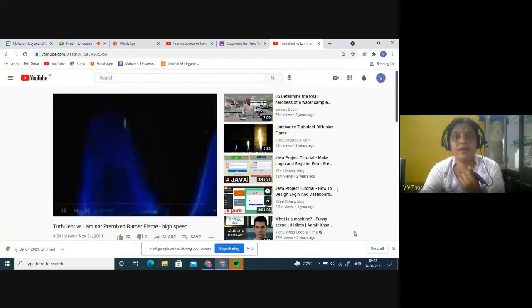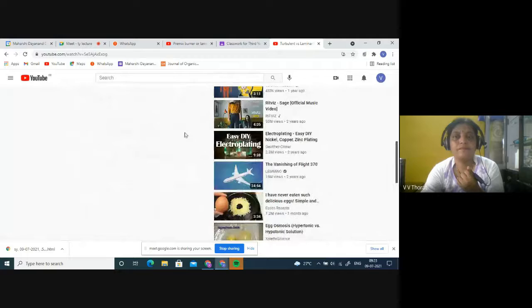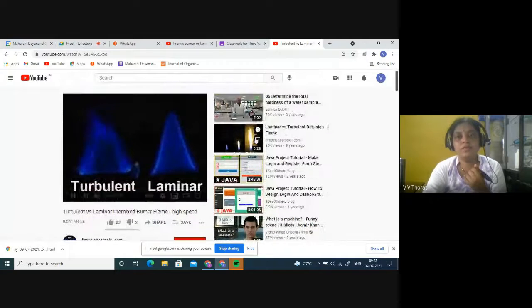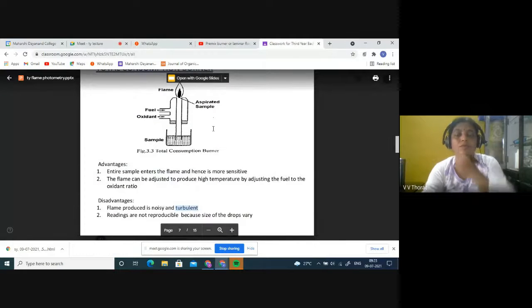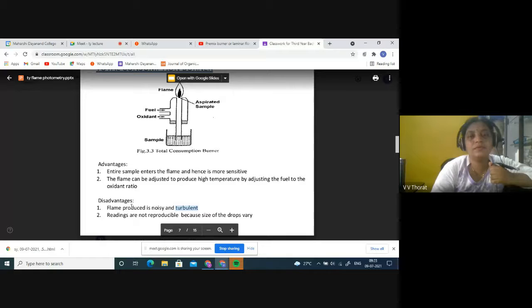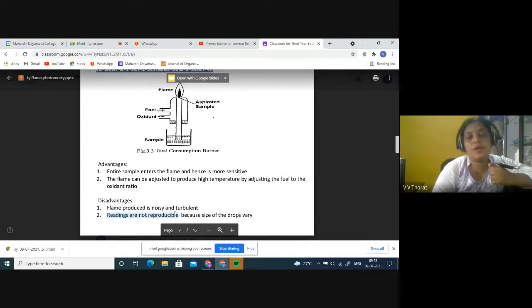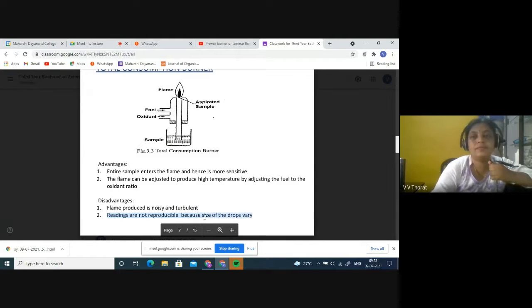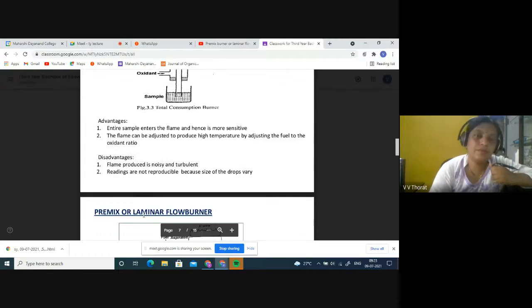There is one more I had seen. I don't know whether I'll be able to trace it. Anyway, you all can Google it when you study. Nowadays, Google is available free. So, in the total consumption burner, the flame is noisy and turbulent. Please don't forget this. Readings are not reproducible as the size of the drops vary. That means all the drops will enter the flame, so the readings are not reproducible.